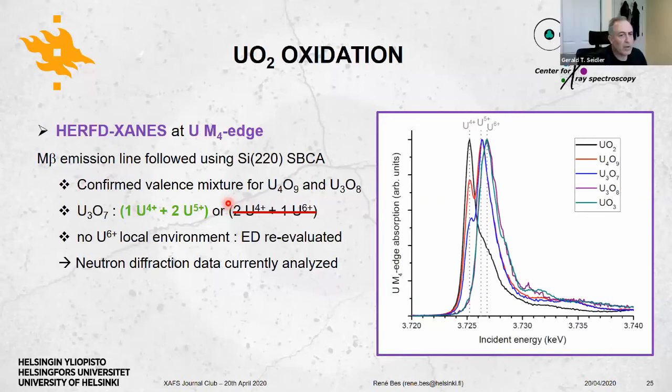Okay. And for the energy, the absorption through the air or the helium bag or whatever will be higher for M5 anyway. So yeah, you have fewer photons.